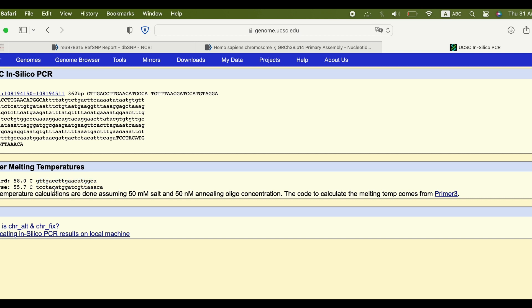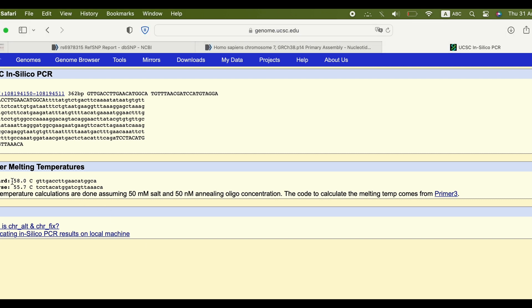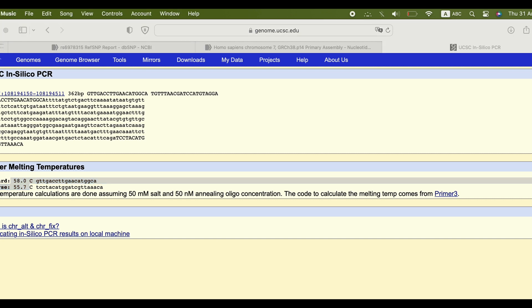The website gives you the primers, the product length, the melting temperature of the primers, the salt concentration, and oligonucleotides concentration. You can apply what you've seen on the inner forward and the outer reverse. The difference in melting temperature between all the primers shouldn't be more than 5 degrees.